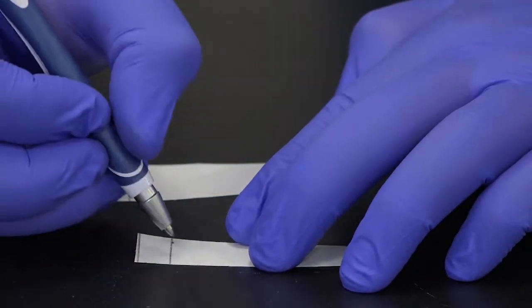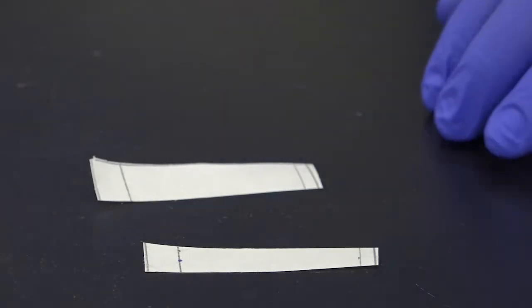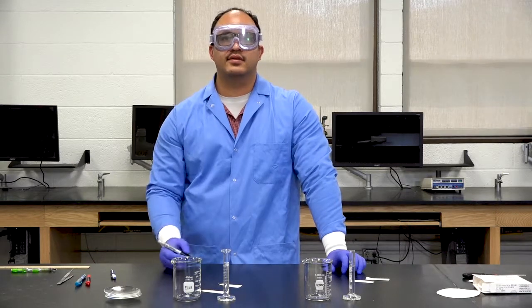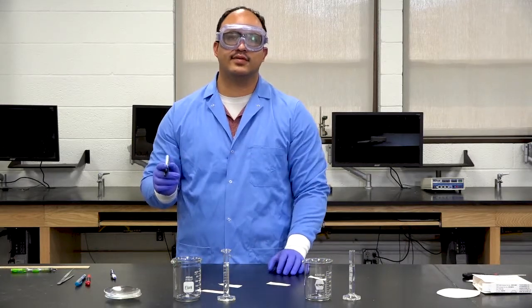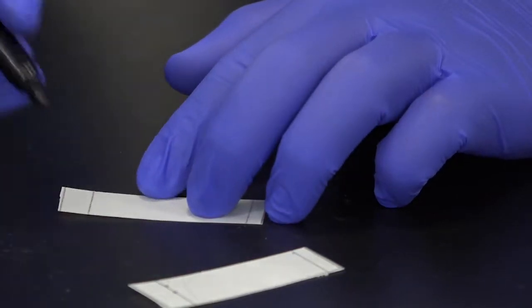All right. You want to do the marking at the center point of the bottom line. For the permanent marking, you want to be extremely fast and light with your touch. You do not want a giant big spot. You want to do the smallest marking possible at the center of the chromatography paper. Just like that.